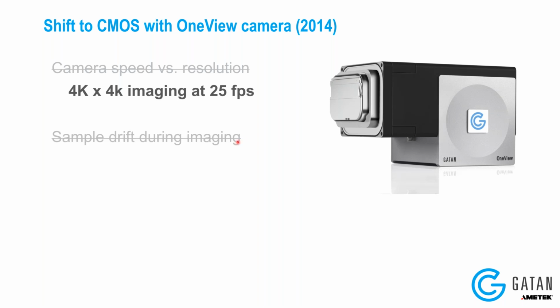The other thing that this got rid of was the sample drift during imaging, because you could do live drift correction of the images as they came off the camera sensor.